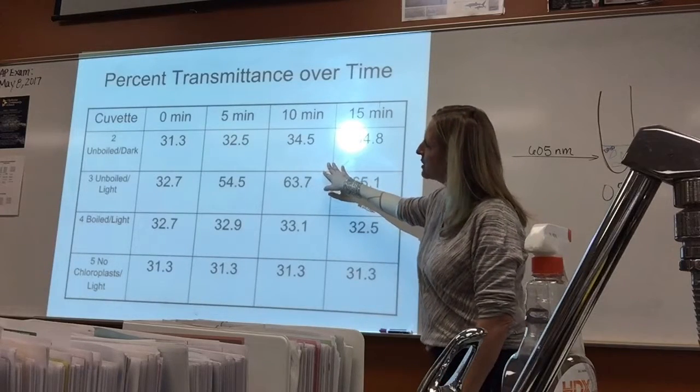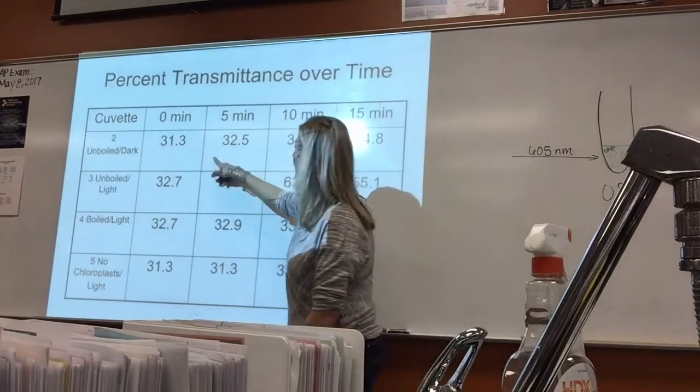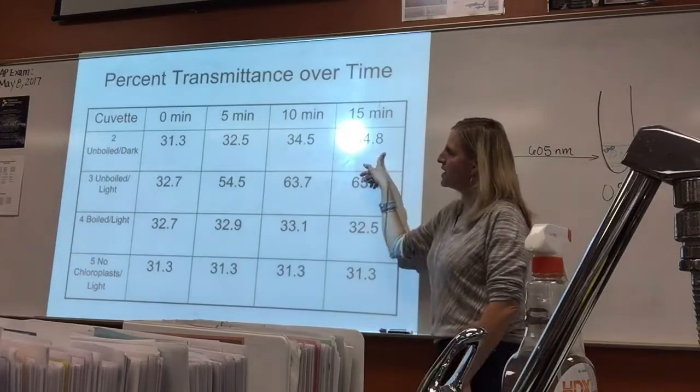The one in the dark. We have a slight increase in transmittance.